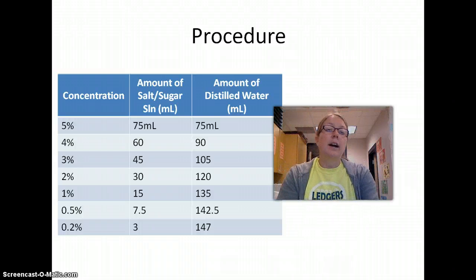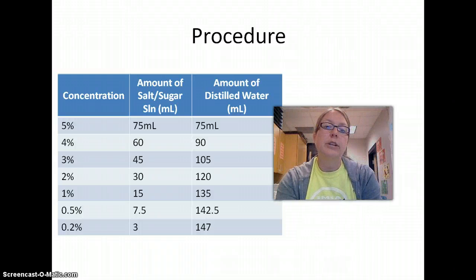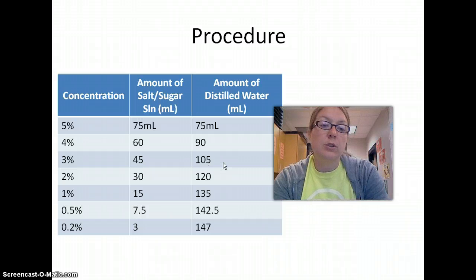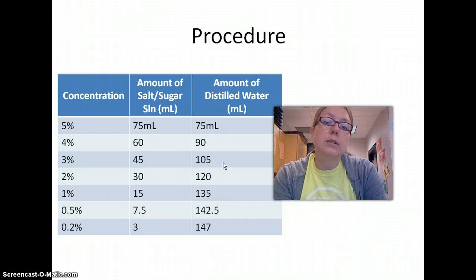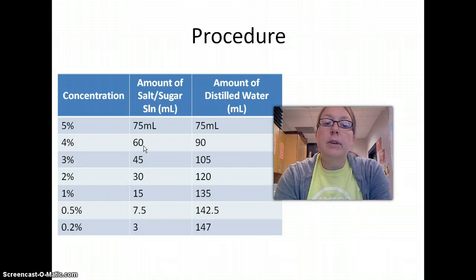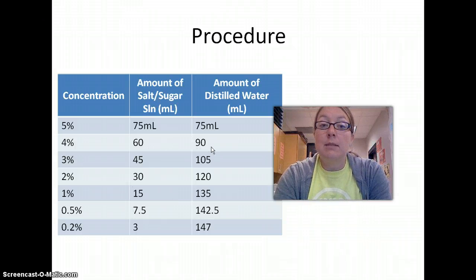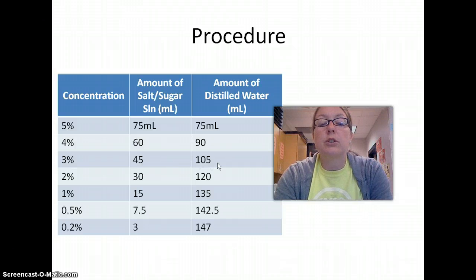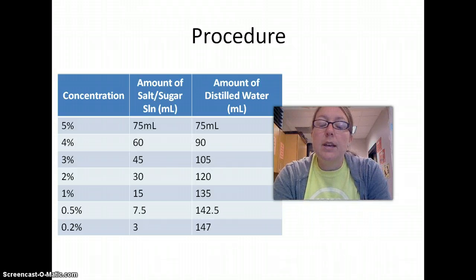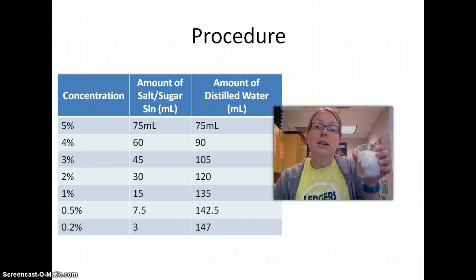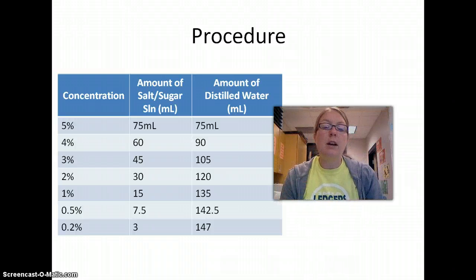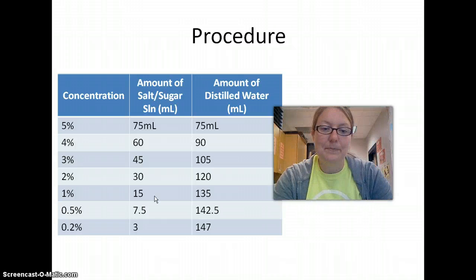For you guys, you may want to pause at this point and figure out what concentrations your groups will be doing, so that you know the amounts of each solution. So if your group does a 4% salt solution, you'll need to measure out 60 milliliters of salt solution and 90 milliliters of distilled water. And for your other egg, if you're doing 3% sugar solution, it'll be 45 milliliters of sugar solution and 105 milliliters of distilled water. Once you have your two eggs labeled and in the proper solution soaking, put them in your class bin of beakers and you're all set. Thanks for listening.